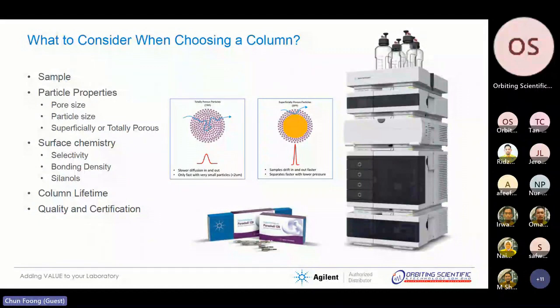Okay, the next is, of course, if you can choose a good column packing technology, then for a high quality column, it should have a better column lifetime. And of course, each column should come with a certificate of analysis.